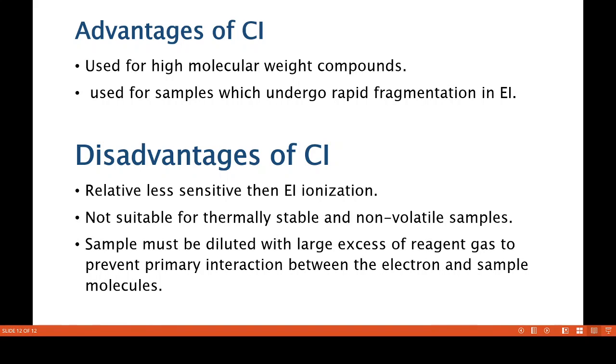This is one of the differences between chemical ionization and electron ionization. Students, you write down the differences between electron ionization and chemical ionization by studying these two techniques.